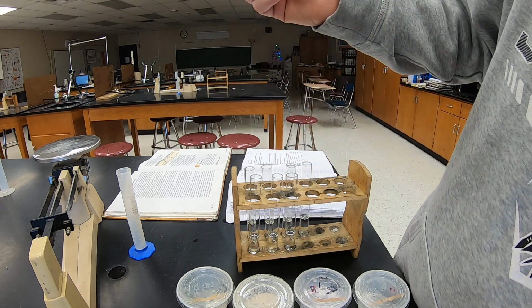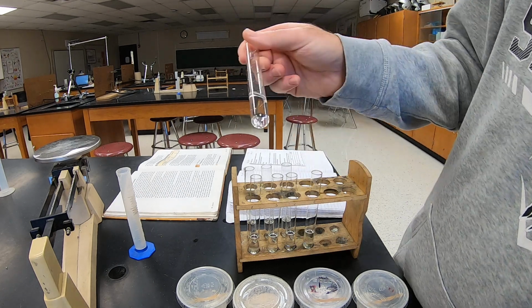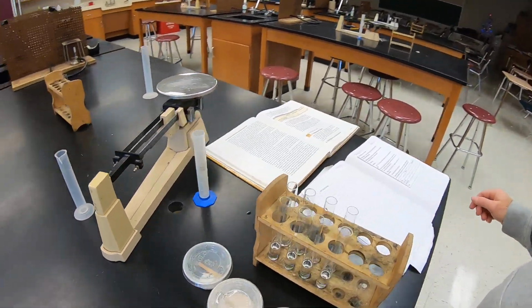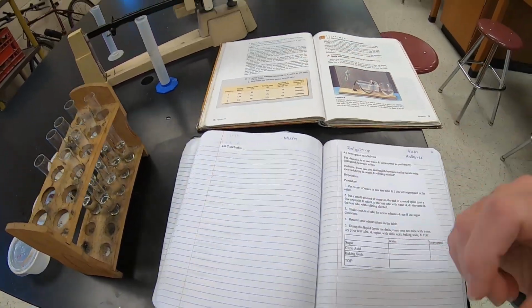Baking soda in rubbing alcohol, there's stuff on the bottom, so it did not dissolve. Baking soda in water, it did dissolve. So go back through and make sure you answer the questions, fill out your table, and get those submitted to me.